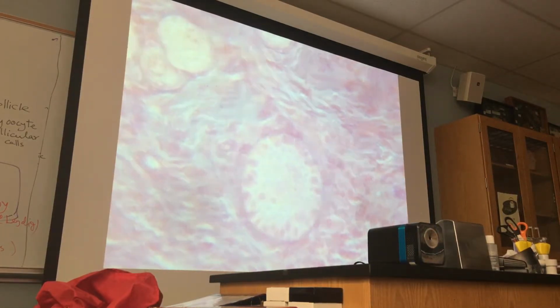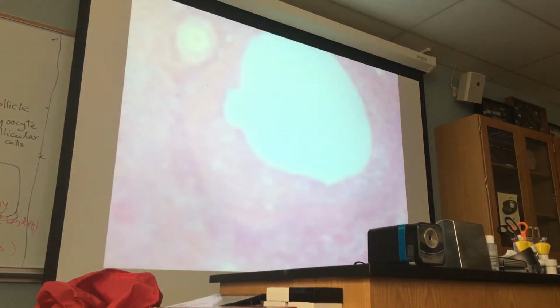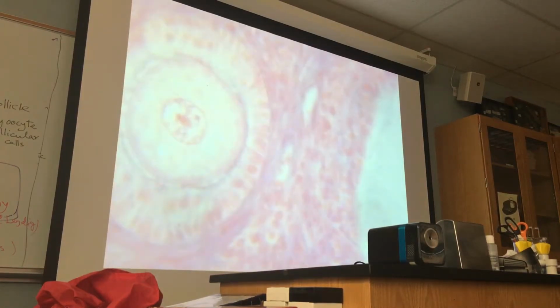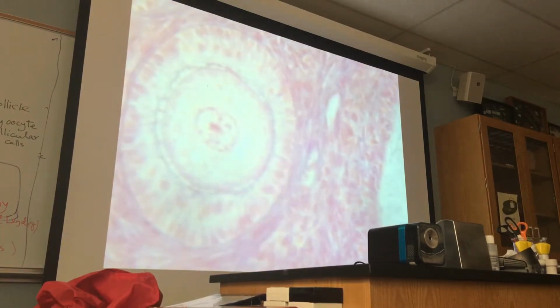Let's go to a late primary follicle. This one is a good one. Look at this. Beautiful. You can take a picture of this. It's beautiful.